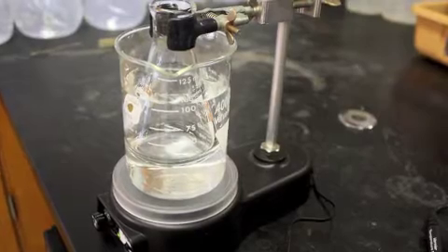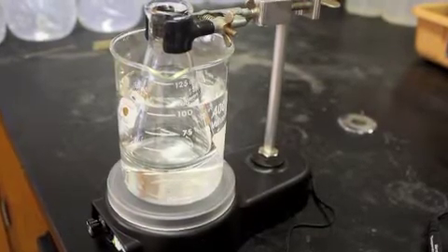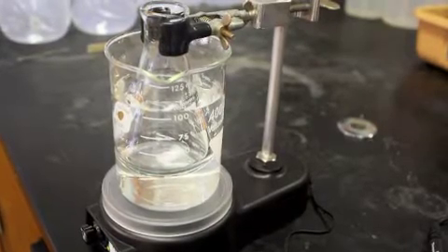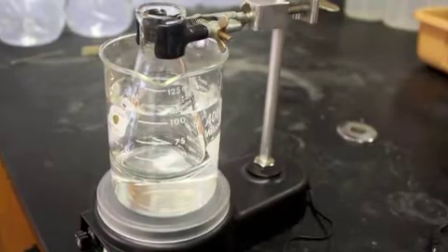Your first step is to set up a 400 milliliter beaker to act as a water bath for your 125 milliliter flask. Secure the flask inside the 400 milliliter beaker with a test tube clamp and tightly tighten it down to the stir station.